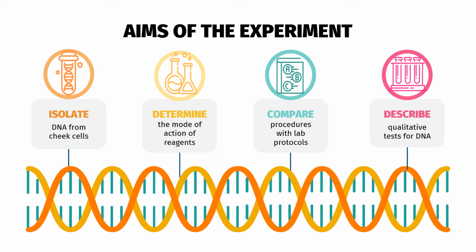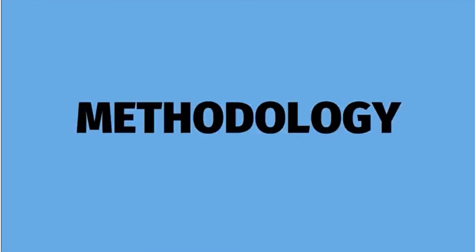And of course, the latent objective of the experiment is to test our skills and resourcefulness needed in the practice of biochemistry. Now let's move on to the methodology.